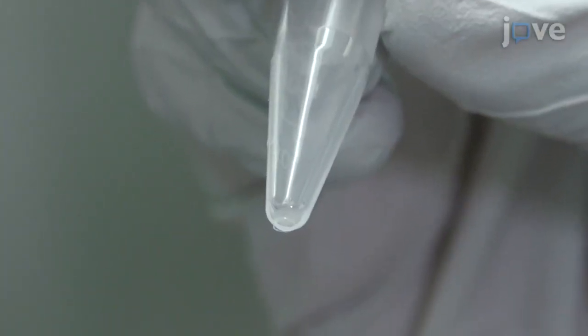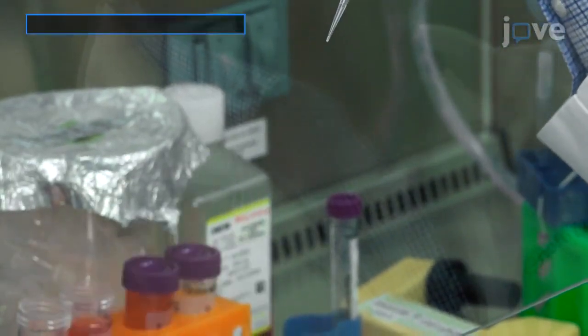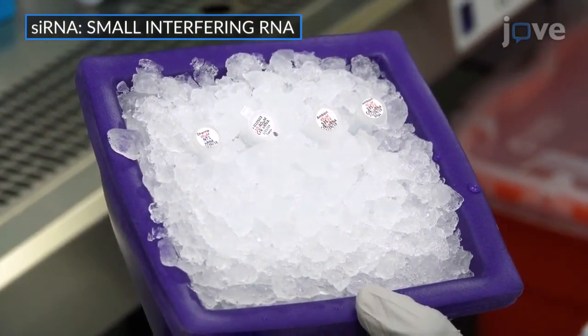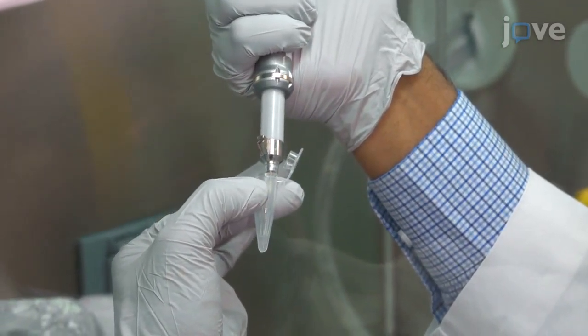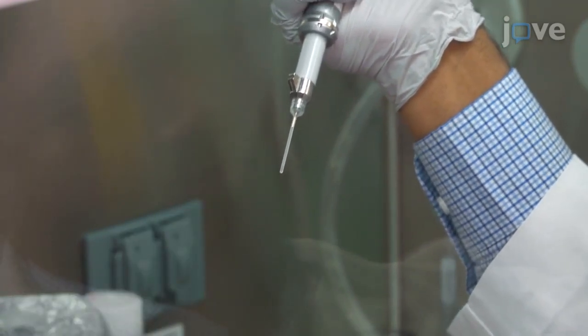After centrifugation, resuspend each pellet in 60 microliters of resuspension buffer R and 6 micromolar of the siRNA of interest. Mix each tube with gentle tapping before electroporating 10 microliter aliquots of each cell suspension with 3 10 millisecond 1350 volt pulses.